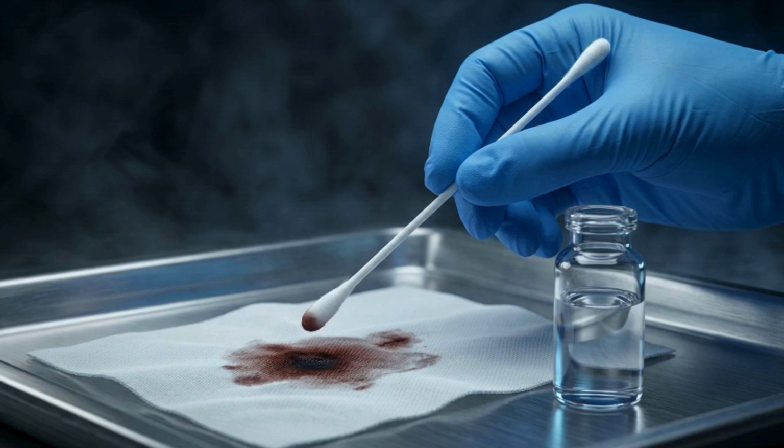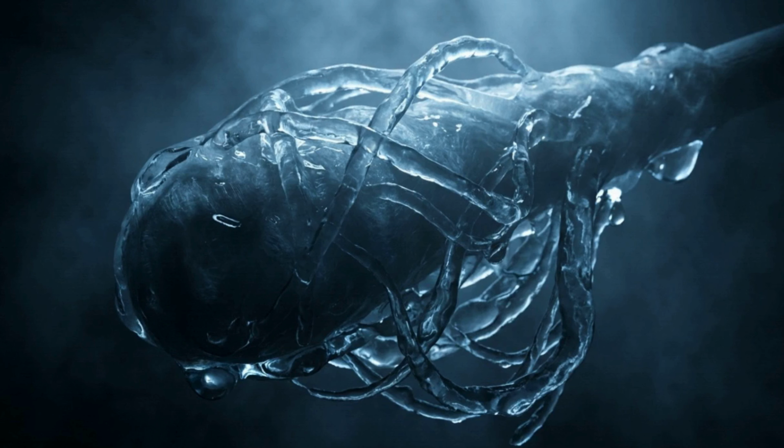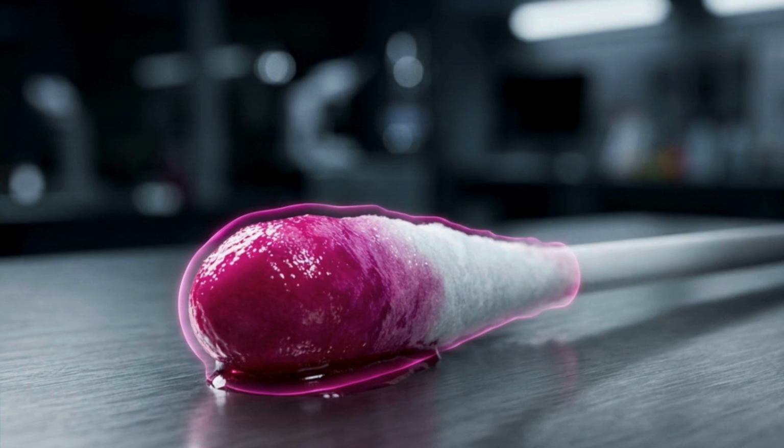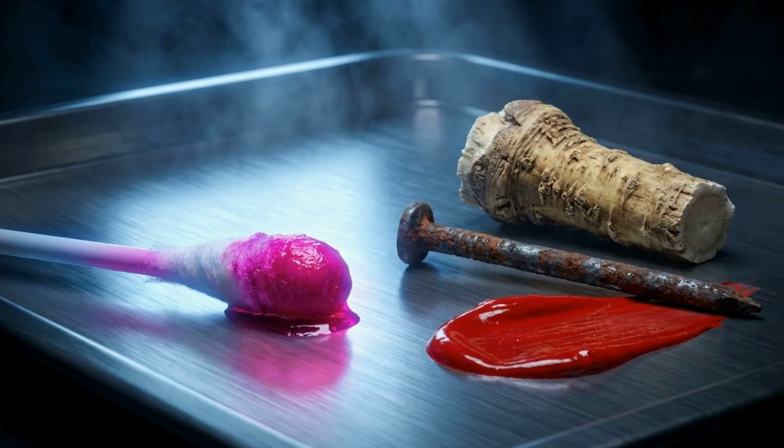Kastle-Meyer or benzidine assays. These swab tests rely on the exact same oxygen-stealing mechanism driven by the heme molecule, but instead of emitting new light, the chemical reaction alters the physical structure of a dye on the swab. This changes how the material absorbs and reflects room light, usually turning it a bright pink or a dark blue. Whether they produce light or color, these tests only provide what is called a presumptive positive. They highlight where the crucial evidence is hiding, but they do not explicitly prove that the substance is blood.